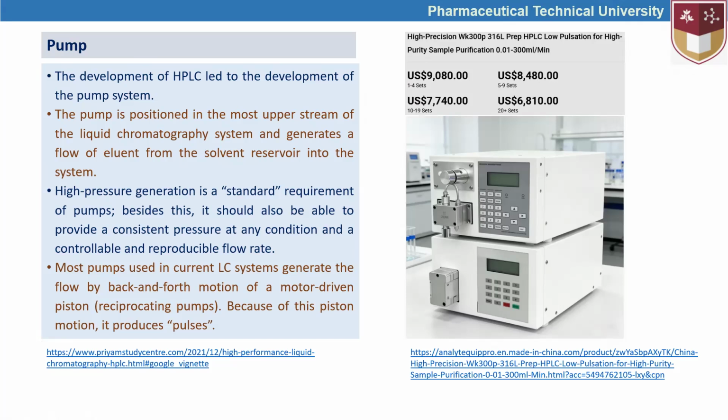Okay, next, pump. Now we are going to talk about the components of the HPLC. Pump is one of the most significant components of the HPLC. And in this website, approximate prices of the pumps are given here. The development of HPLC led to the development of the pump system. Now we have updated highly precise HPLC because they are equipped with highly precise pumps as well.